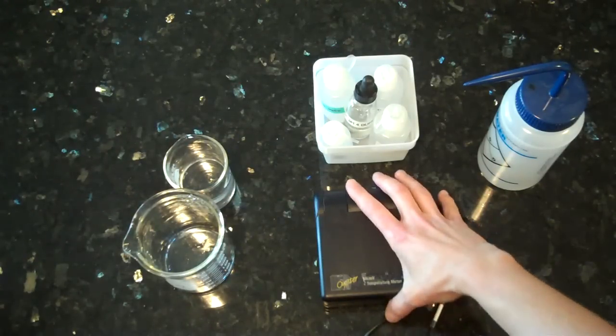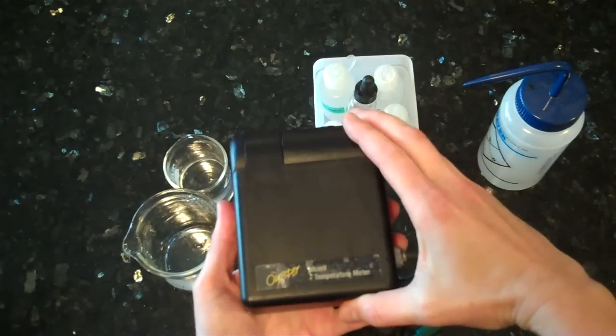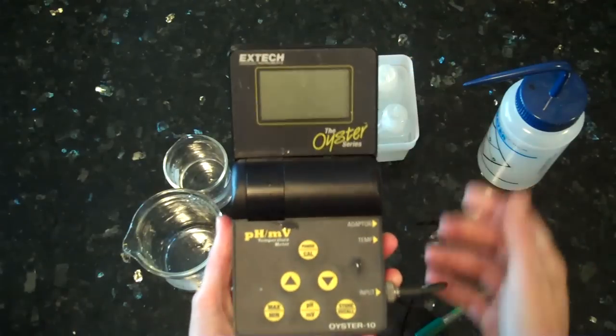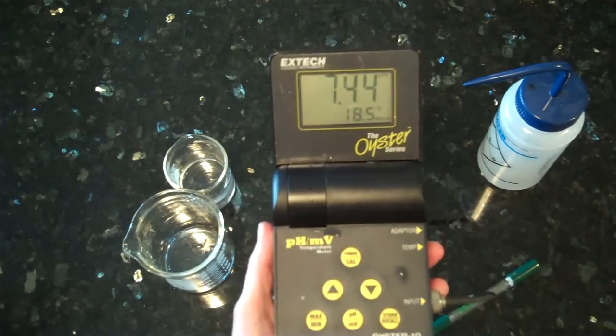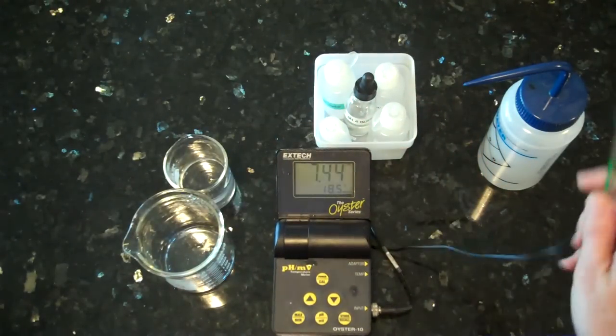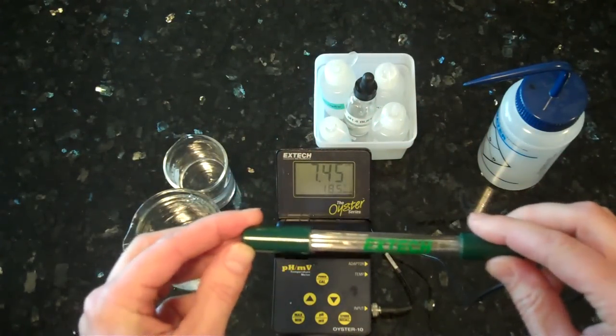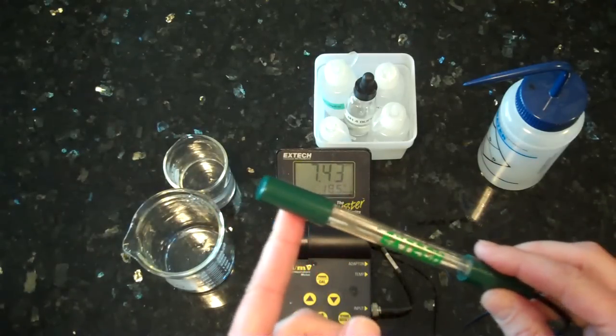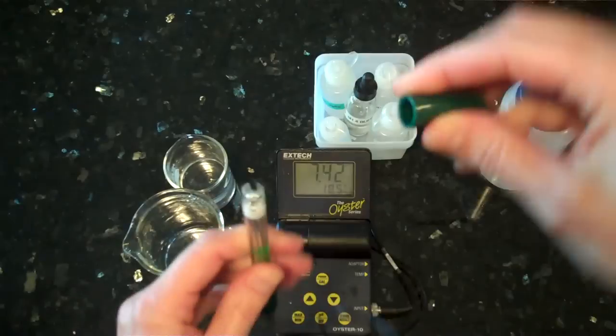Our pH meters are shown here. The way you use it is simply to open it up. There is a power button, and you turn it on. Now attached to this pH meter is a pH probe, and the pH probe has a green cap. Before you use the pH meter, you need to remove that cap.